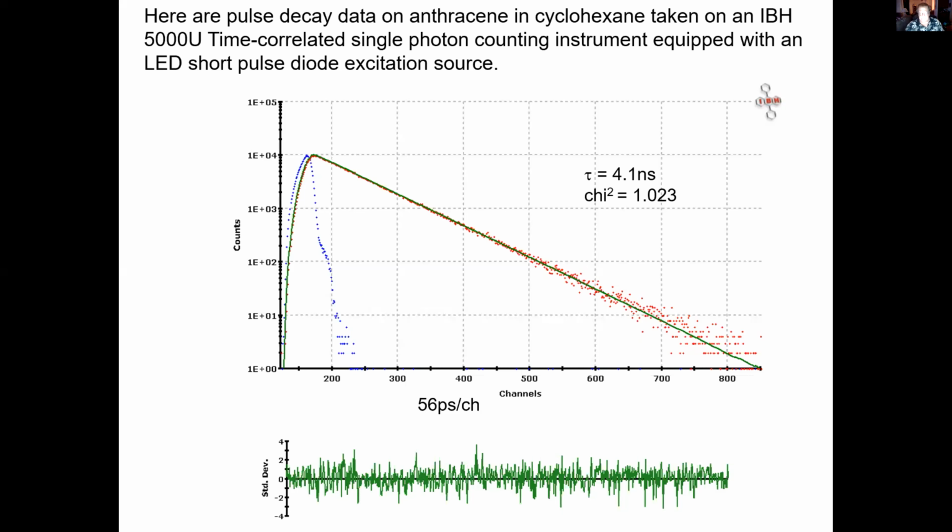Now, you fit a model, and then you test the data to your model, and that's illustrated. That gives you what's called the chi-squared value, and it's illustrated below, where we see the straight line is the actual best fit, and then we see the scatter of the data points above and below that. So when you get a nice flat curve like that, that's a good fit.